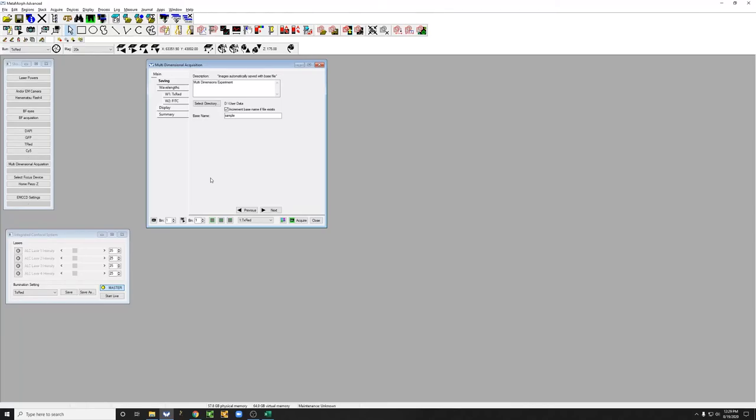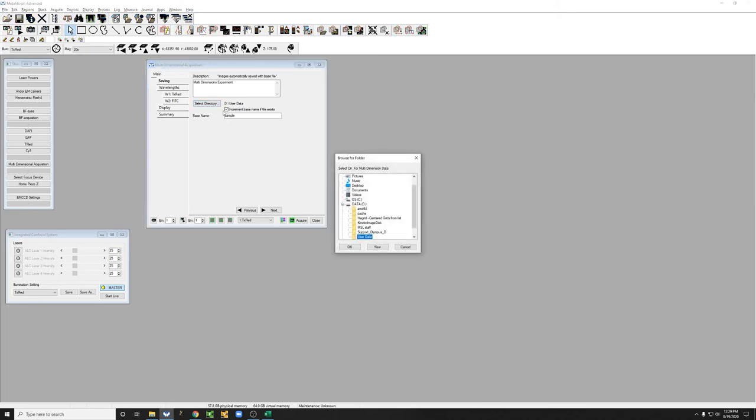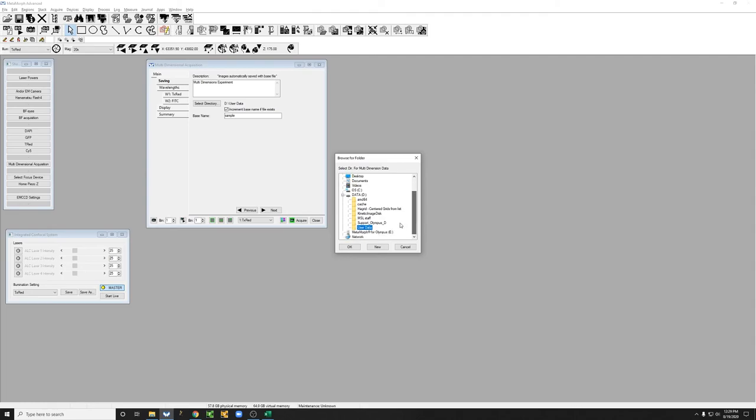First, select the directory where we want to save the data. If you look here, you'll see that we have a C drive and a data or D drive. You always want to save your data in the D drive, and you always want to save it in user data.